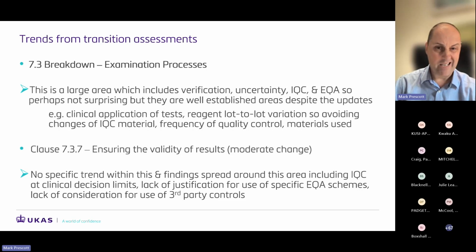That's one of these where I say could be considered surprising. I'm sure you'll all be familiar with conversations around the use of third-party controls. There's not an awful lot changed in the standard as regards that, but it is something which is still coming up quite a lot. And it really just requires labs to justify a lot more why they're using the controls that they are.